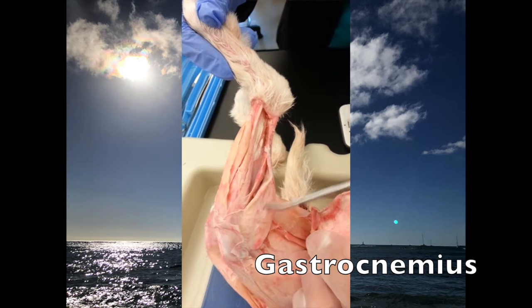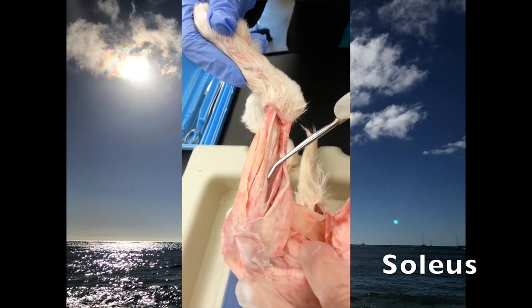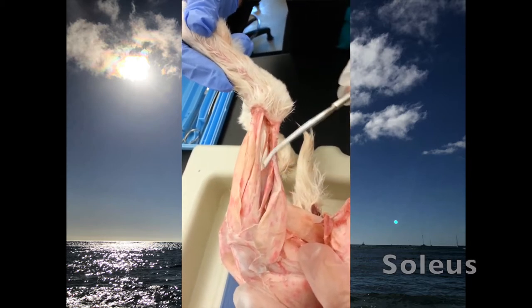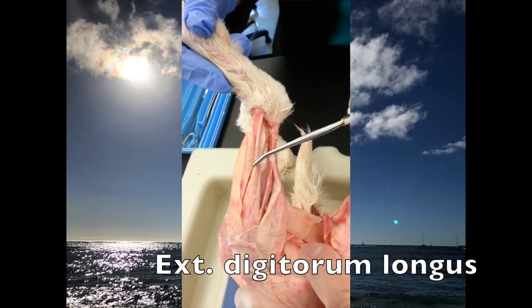This one's the gastrocnemius, and the little one's the peroneus. This one's the soleus, this one's the peroneus, and then this one right here is the extensor digitorum longus.